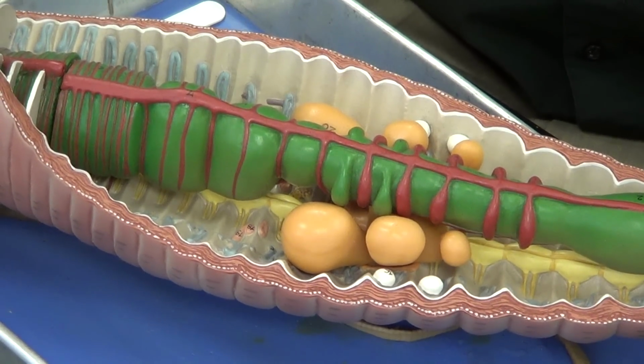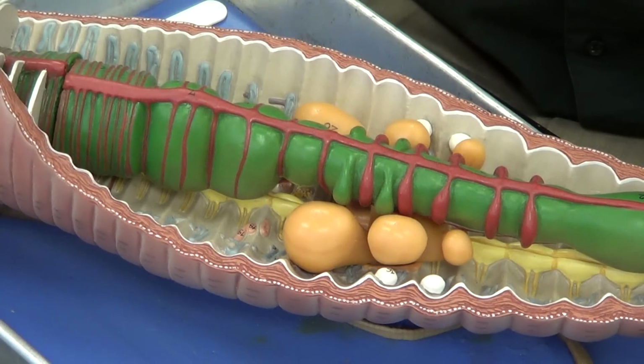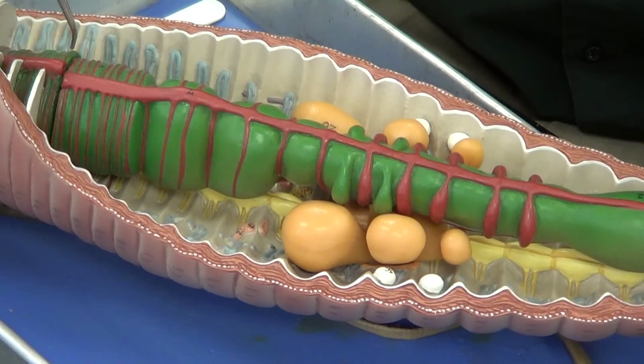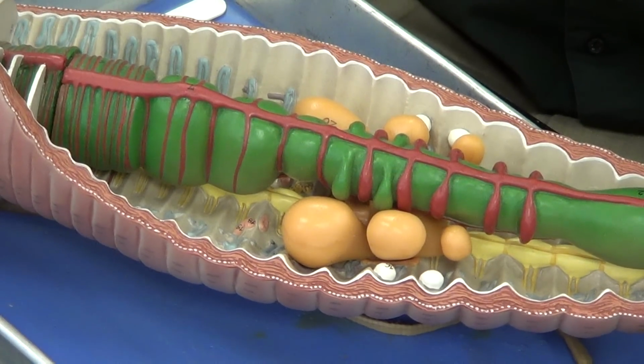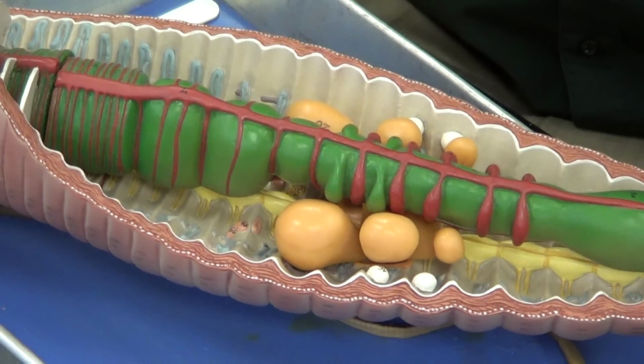And it's going to be that way for a reason, because we're trying to digest and absorb small bits of organic material mixed in with lots and lots of topsoil. So in order to do that, we have to create lots of surface area. And we're going to do that in two ways. One, we're going to have a very long intestine.